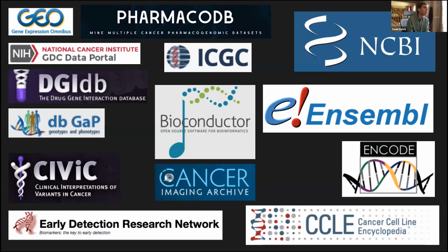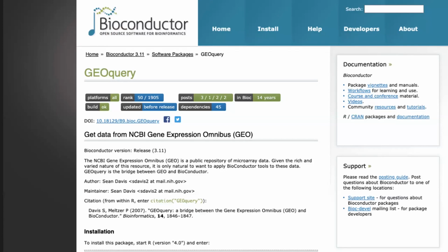And again, you can build your own tools to do that kind of thing, but Bioconductor has that middle piece, the data container, the SummarizedExperiment, or other data containers that allow us to jump off quickly to analysis. I'm going to talk quickly about two packages.